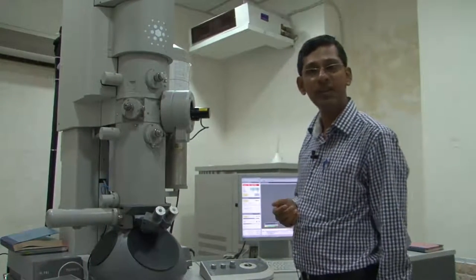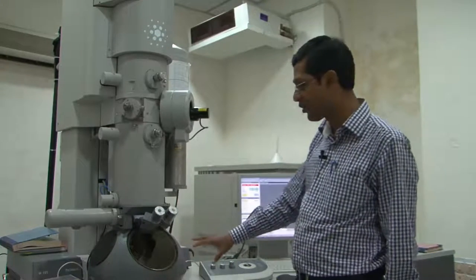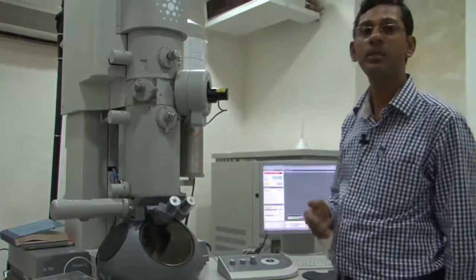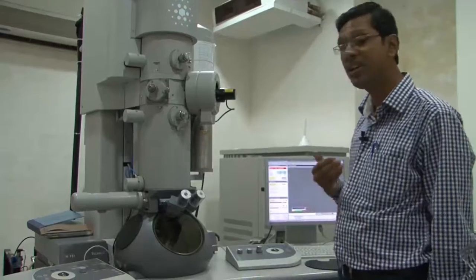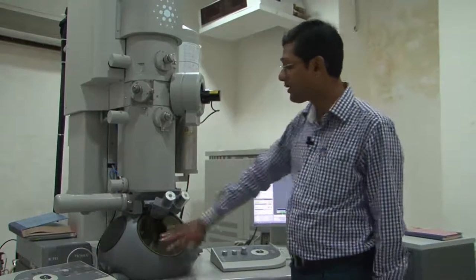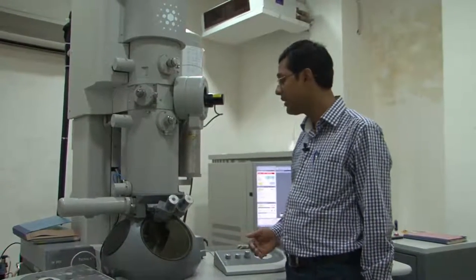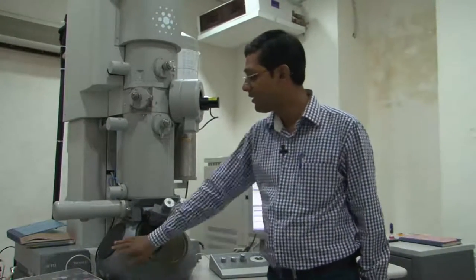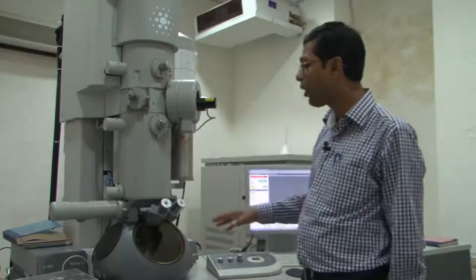Obviously, electrons cannot be seen in a microscope, so one needs to have a viewing screen. And if you look at any microscope, this is the viewing screen with the binoculars. And the viewing screen is nothing but a fluorescent screen made of zinc sulfide, on which if an electron falls it can create light. And our eyes, human eyes, can only see light, cannot see electrons. If the electron falls in your eyes, you will be blinded. So that's why this is fully protected. There is a lead-based glass, which will not allow anything to come out of the sample. So remember, this is very hazardous equipment unless and until it is protected. So that's why all these things are nicely covered, and you cannot tamper with them. You only view the screen and do all kinds of analysis.